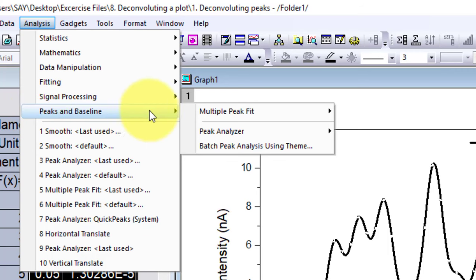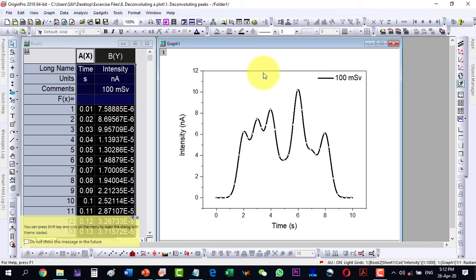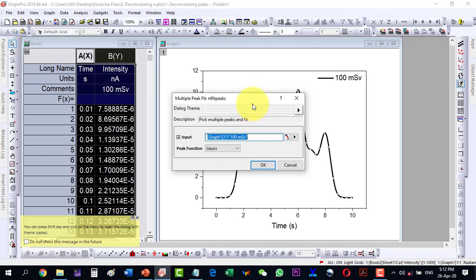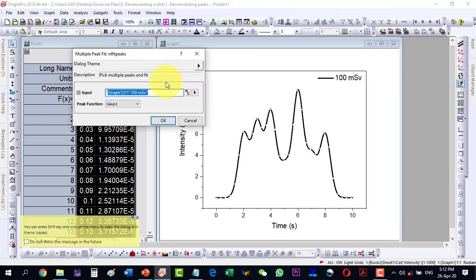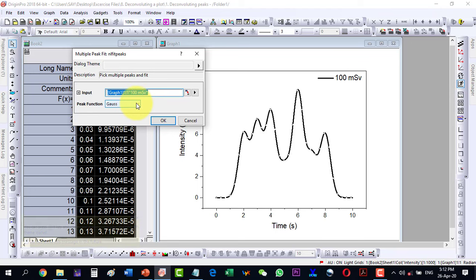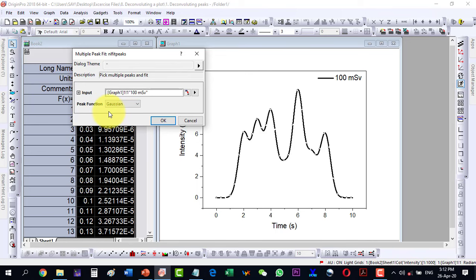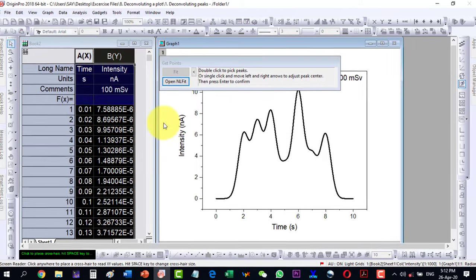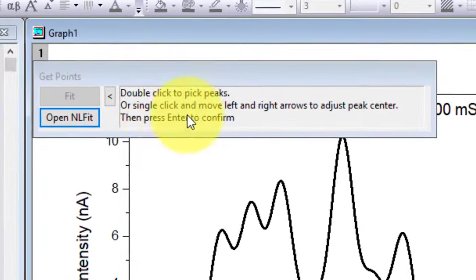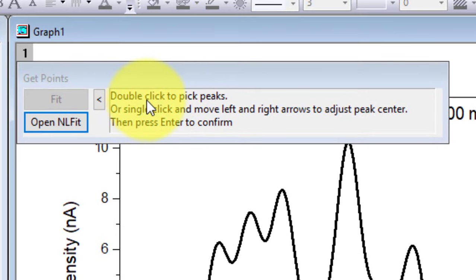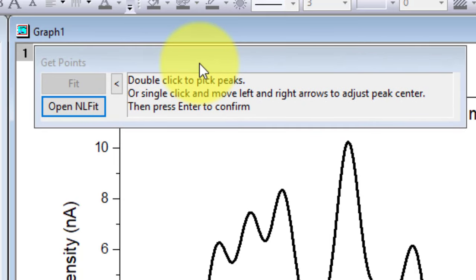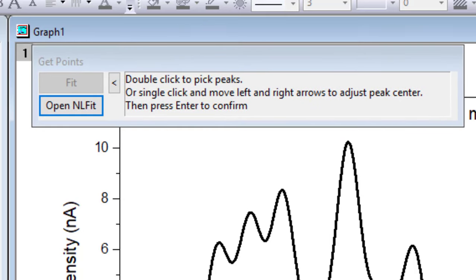Let's select a plot and from the Analysis menu go to Peaks and Baseline, then Multiple Peak Fit, and then Open Dialog. Now the dialog will open. It will show a box with a menu for how the fitting will be done. I select Gaussian and click OK. It will open a new menu.